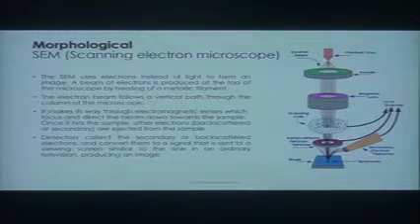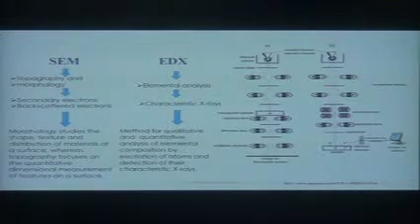It doesn't give you a color image, right? It's not like an optical microscope. You can colorize these things. I know it's easy in Photoshop nowadays, but it gives you a black and white image, and it can tell you much about the surface structure. For us, in my work, and I think in almost all of the laboratories around the world working on energy materials and nanotechnology, this is a very common screening technique, and the hardware for scanning electron microscopes has become quite common and relatively affordable.